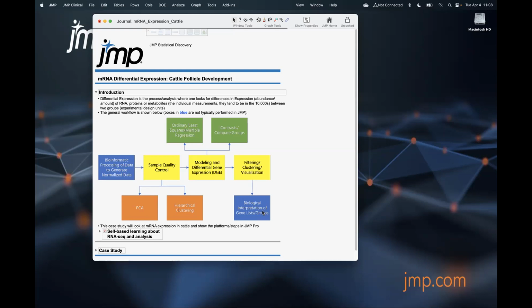And then usually your next step in that workflow is extracting those gene sets and going out for interpretation. You go out to some pathway analysis tools, some network generation tools. You can export all of that and continue on with that workflow. So we're this middle piece. That's where we sit, all right?